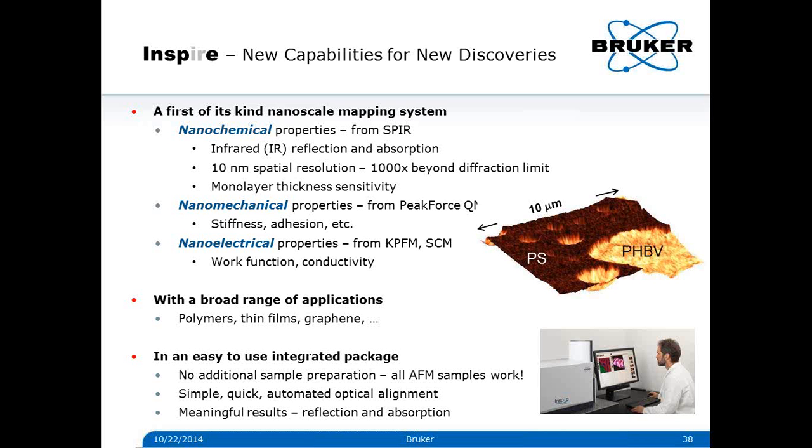If you use a CO2 laser, it would also be around this range, and you can go up to like 2,400, 2,500 wave numbers, maybe even above. You can continuously find lasers in that range that are tunable, each laser in a range of around 100, sometimes up to 300 wave numbers. So we can cover a big part of the interesting infrared spectral region, and that we would offer with the system.